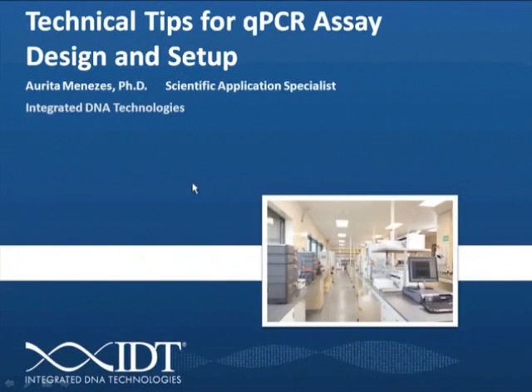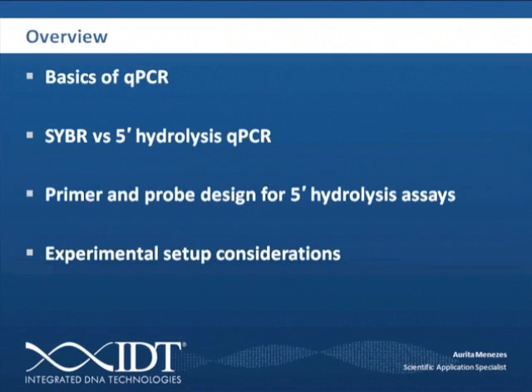We're going to talk about some technical tips for qPCR assay design and setup. I'm just going to give you a basic overall view of what I'm going to cover today. My main focus is going to be qPCR hydrolysis probes. So I'm going to start with the basics of qPCR.